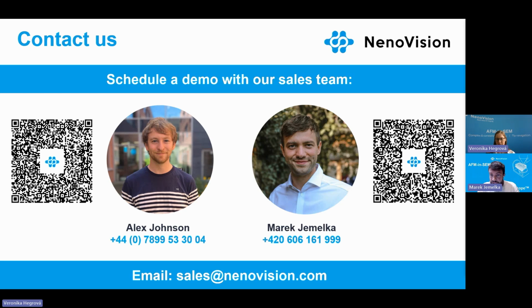Here is a question from Leonard. How many samples can you mount at the same time for a comparative analysis? Very good question as well. For the standard scanner, we can load 3 samples. For the rotational scanner, basically there's 4 by 4 centimeters, as many samples as you can fit. It depends a lot on the size of your samples.